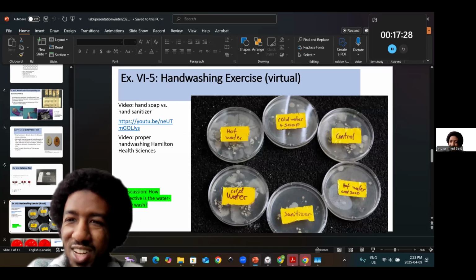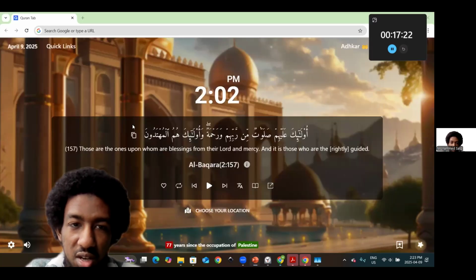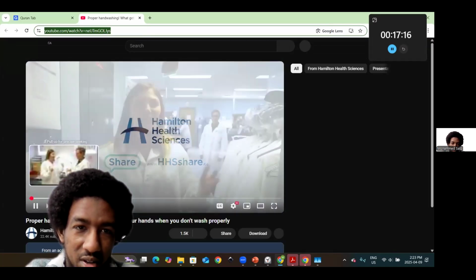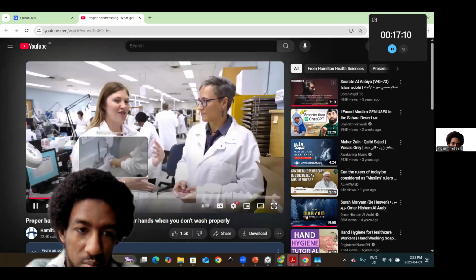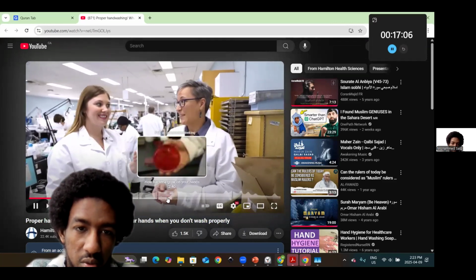Now, hand washing, we did just describe this, but I hope if you have a look at this video, it's something that's quite interesting indeed. I recall looking at this, it's quite profound in the sense that you can have a grandeur of many bacteria that can grow over a period of time. And there are different techniques that you would use, right?